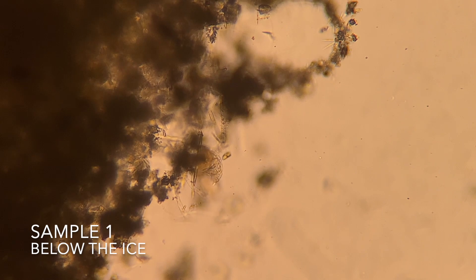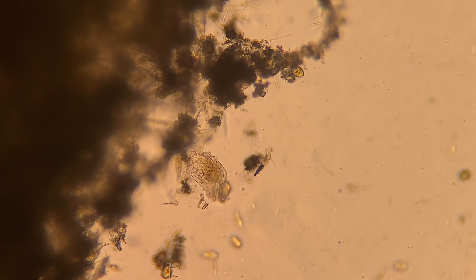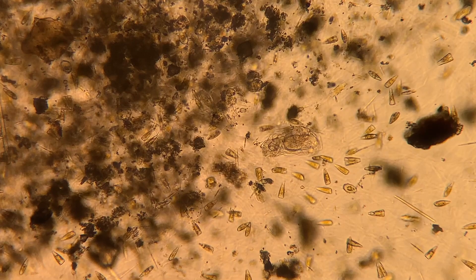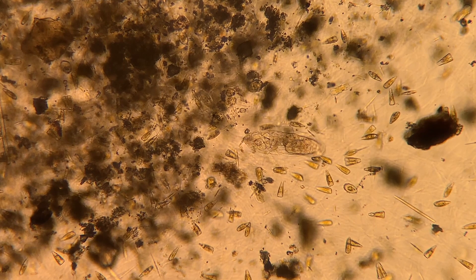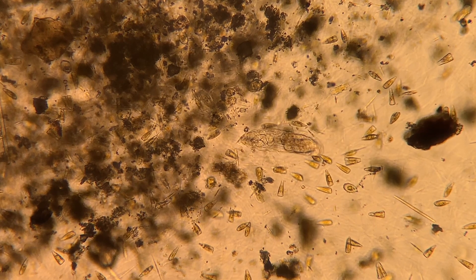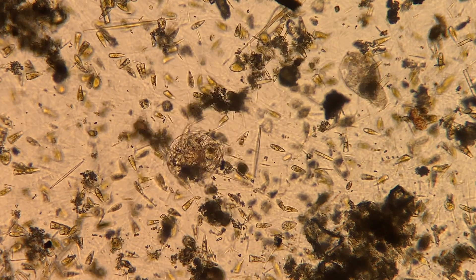Last but not least, let's take a look at the sample that was underneath the ice by about 2 or 3 inches, with some algae. First we're going to be looking at some rotifers. Here's a copepod and a rotifer just shooting the breeze together.